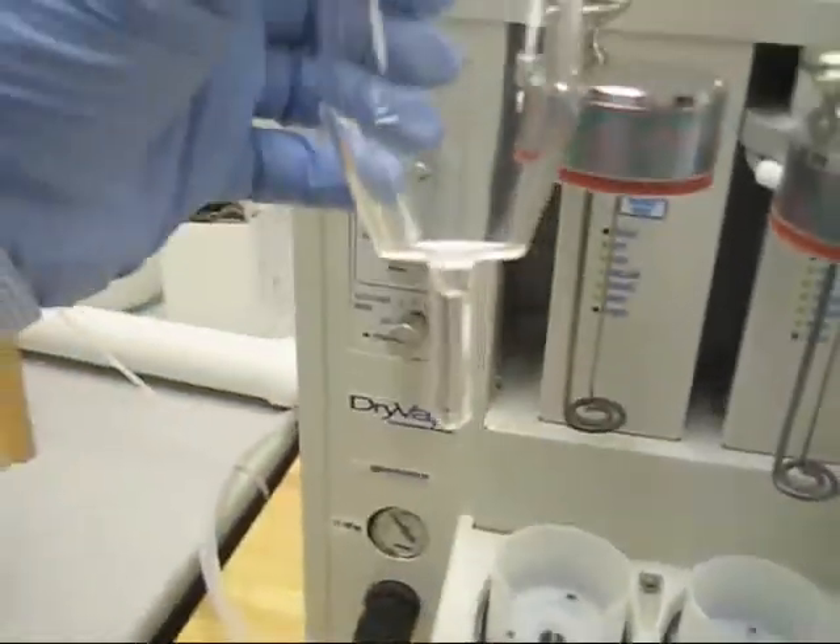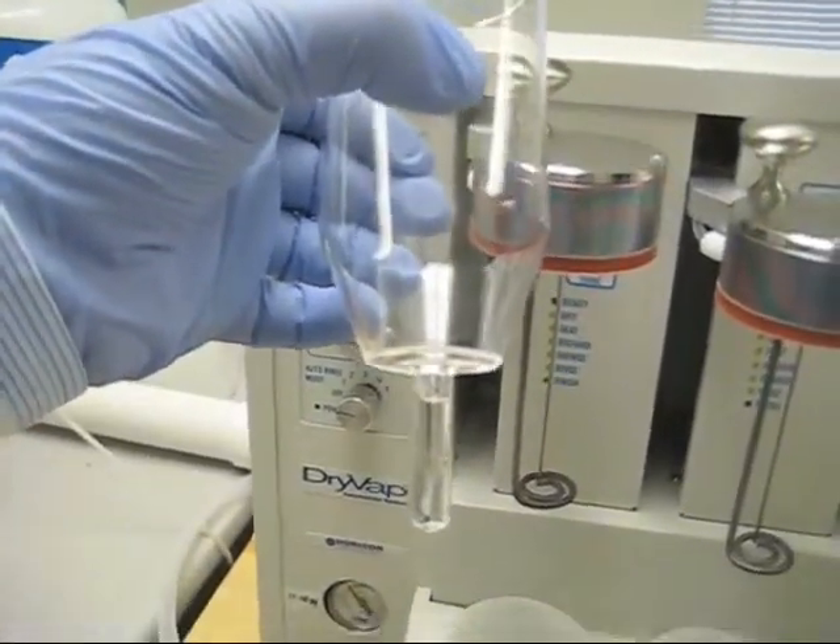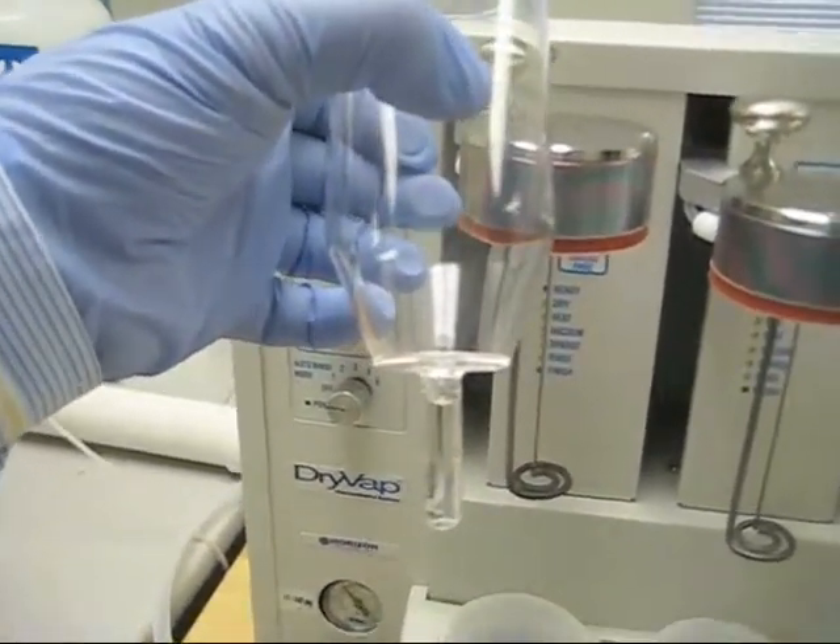We can see that you're right at the one mil mark. That one mil mark is calibrated plus or minus 20 microliters.